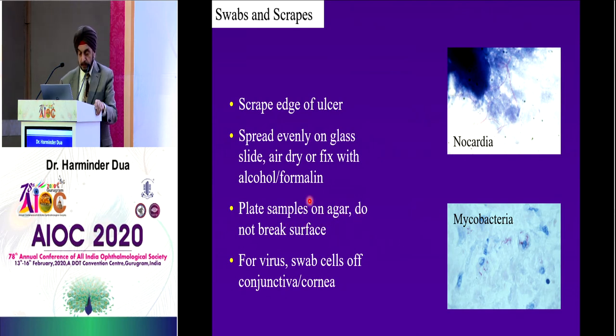And then on the agar plates, you have to plate the sample in a shape. You give it a C, you give it a cross, whatever you do. Why do we make the C or parallel lines? The reason is that any bacteria growing in that C has come from the eye. Any bacteria which is a contaminant will be random on the plate. So if you give a shape, then you know that that's what you're looking for. So that's why we make it in a certain pattern.